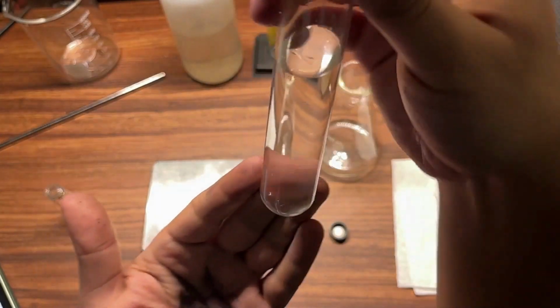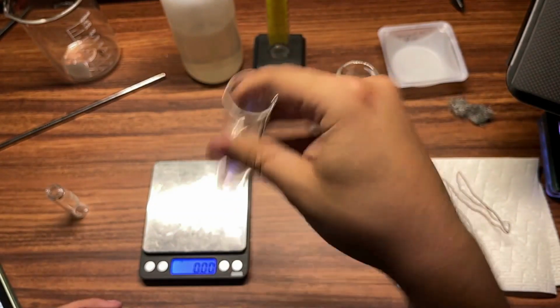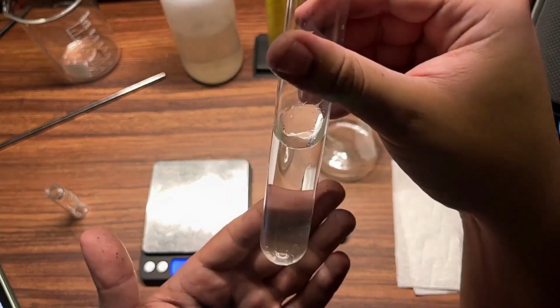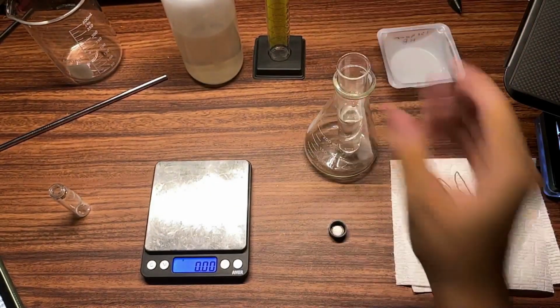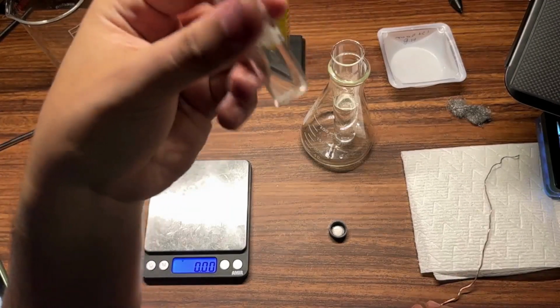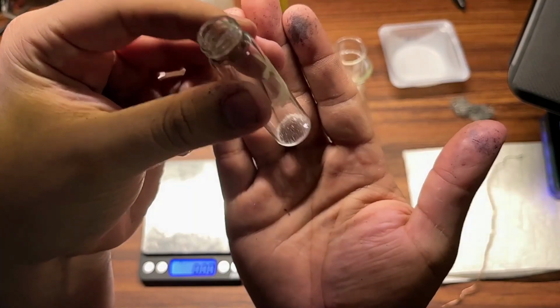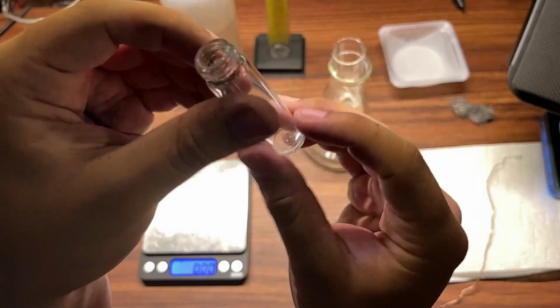And I see a few particles floating around in there still, so I'm going to keep swirling. And now we're good. All that silver nitrate is dissolved. I can put that down here because I need to prepare my copper coil. Actually, check this out. Look, there's some silver nitrate. I don't know if you can see. There's some silver nitrate still in the vial. That is an issue.